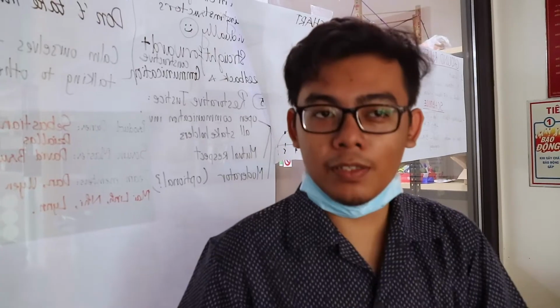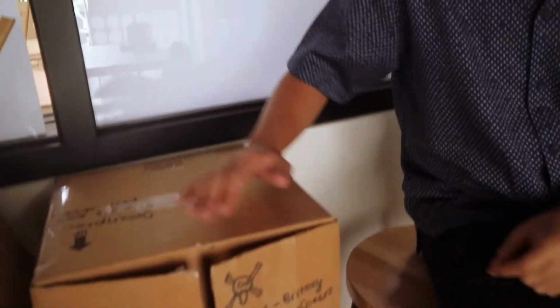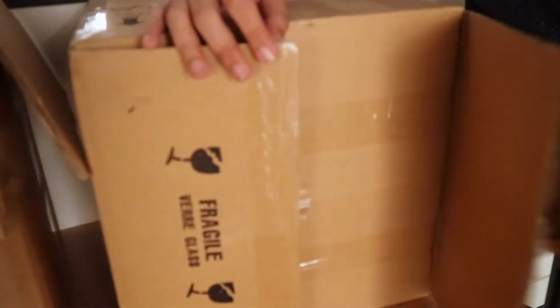Okay. And see what kind of colonies and the shape of the colonies they grow. So now we are going to open the incubator and see what sits inside. Yeah, it's not very secure, but it's a makeshift incubator. See? See what's on this?